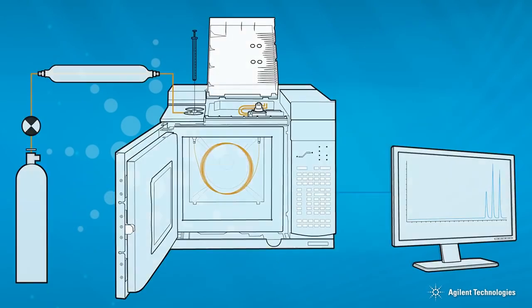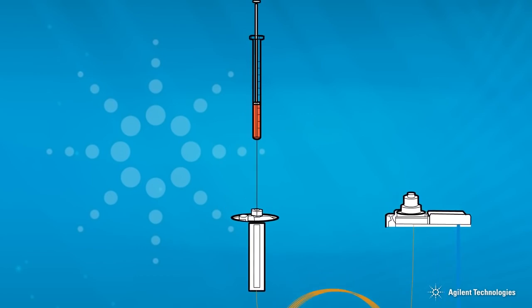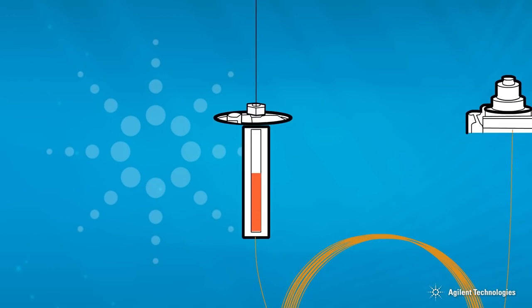The syringe with the GC sample to be evaluated is inserted into the heated injection port through the septum. The septum is a rubber seal that isolates the GC carrier system from the outside atmosphere. The plunger is depressed, injecting the sample into the hot injection port. The injection port is sometimes referred to as an inlet. The inlet usually has a glass liner or sleeve that provides an inert area for the vaporization of the sample. There are different designs and internal volume liners depending on the application.